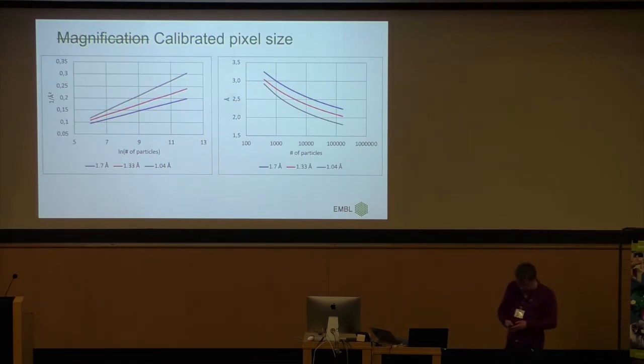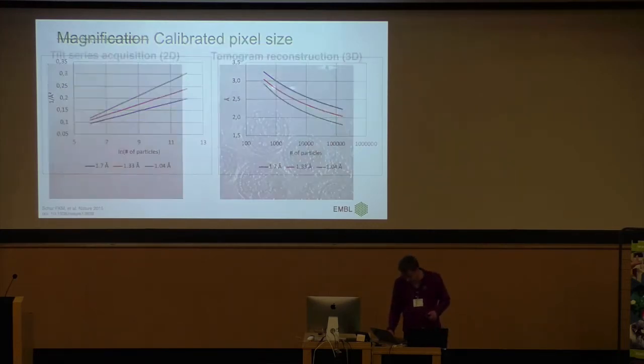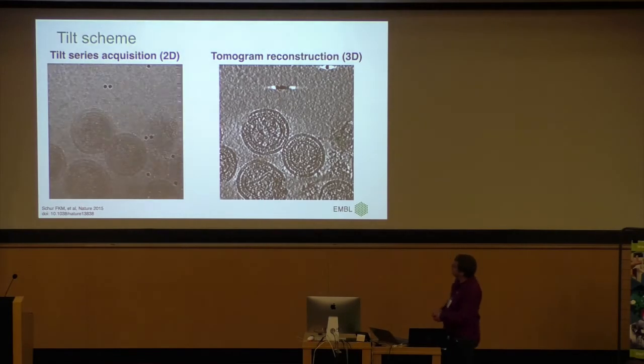We do this high resolution subtomography at very high magnifications, so small pixel sizes. And just to show, this is an experiment I did a while ago with some apoferritin. You just use one square, set up 3 groups of positions, shoot some apoferritin, plot the B factors, and then it's very obvious that when you go higher in mag, you have a better DQE, you get to higher resolution much faster. It's just a repeat of an experiment that Scott Stagg published, I think, in 2006. So high mag means small field of view.